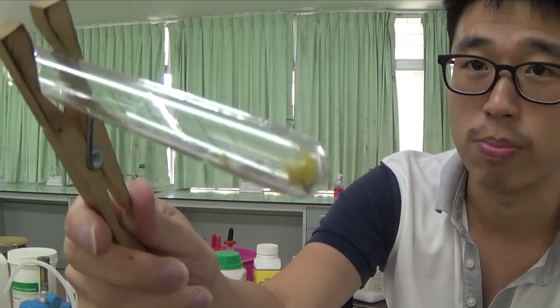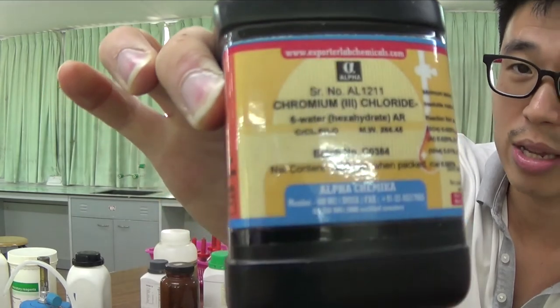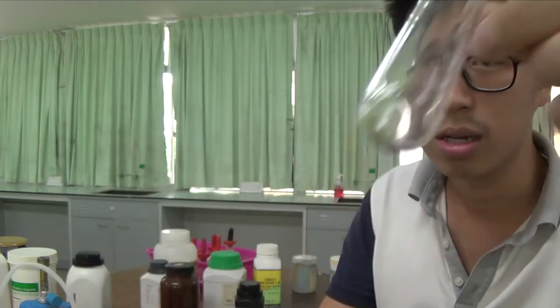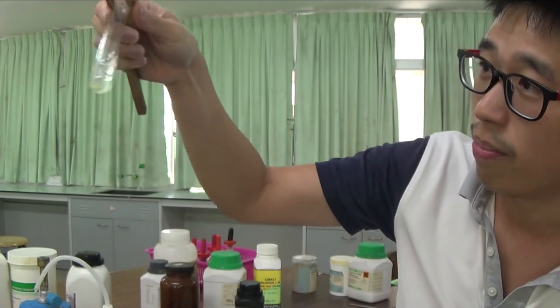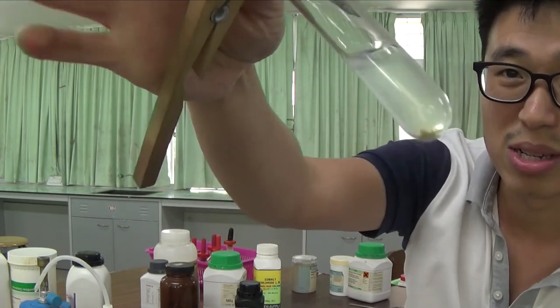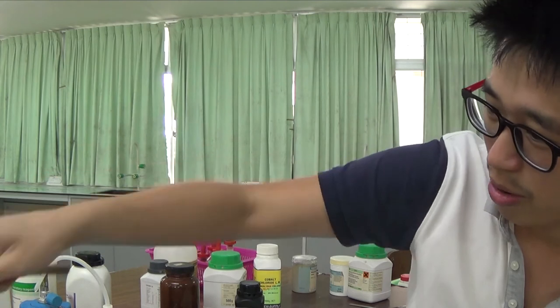Remember, this was the chromium 3 chloride, which was green, the hydrated. Remove the water of crystallization and it's gone yellowy. So I add water to it. Or maybe it doesn't want to go back. It's not very soluble now. I don't think this one wants to go back, you see? It doesn't want to go back at all. So there must be some underlying reactions that make it not want to go back.